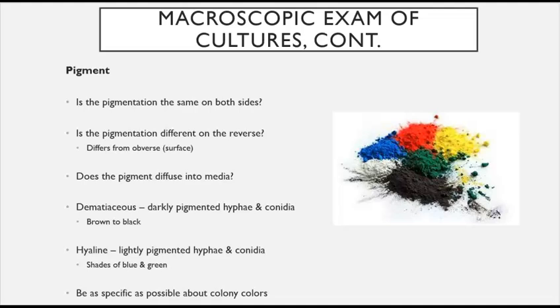Is the pigmentation the same on both sides? Is it the same on the top of the plate as it is on the bottom of the plate for the colonies? It may not be. Is the pigment diffused into the media?